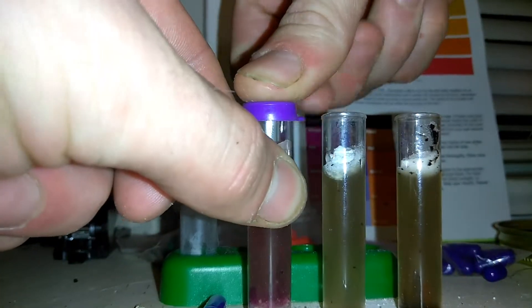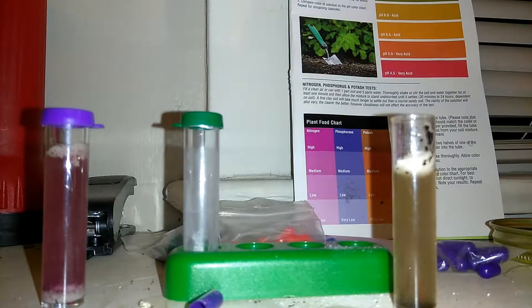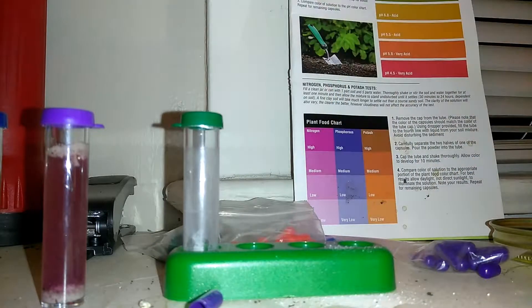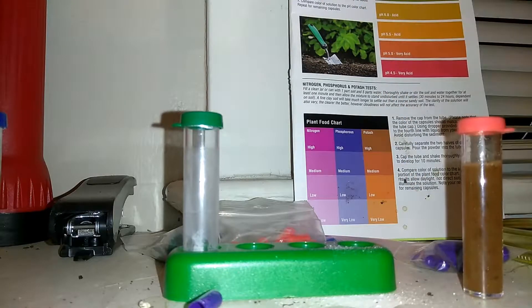Put the caps back on very carefully. You don't want to tip over or spill anything because then you're obviously wasting the test. Now once you put the caps back on, shake vigorously for about 10 to 20 seconds each one. And then you wait for the results. After you shake them, let them sit for about 10 minutes. And we'll be back.